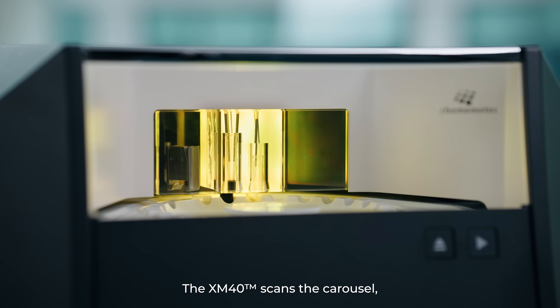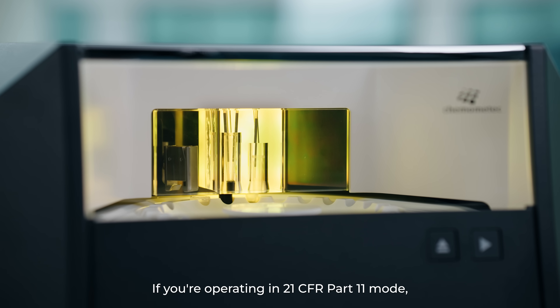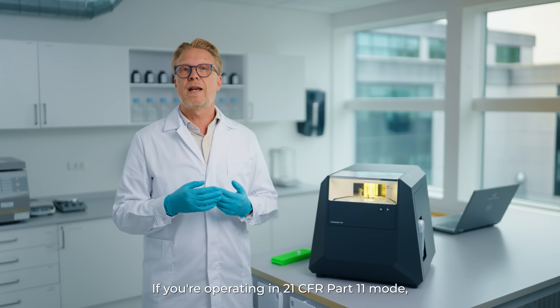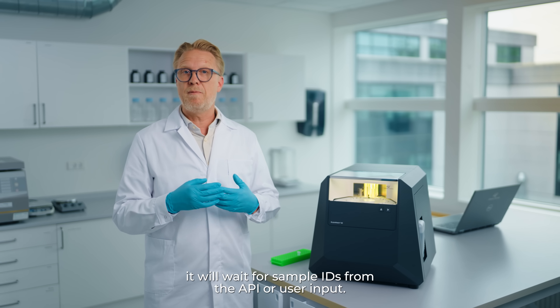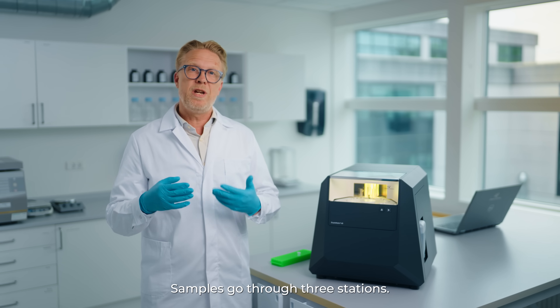First, the XM40 scans the carousel, detects loaded samples and begins the analysis. If you are operating in 21 CFR Part 11 mode, it will wait for sample IDs from the API or from the user input.